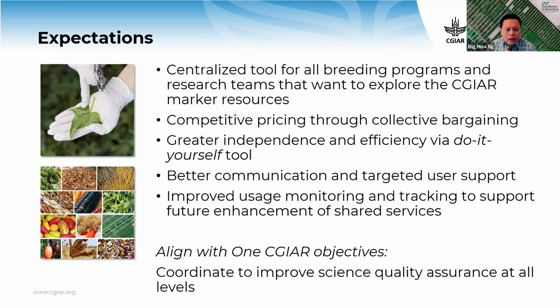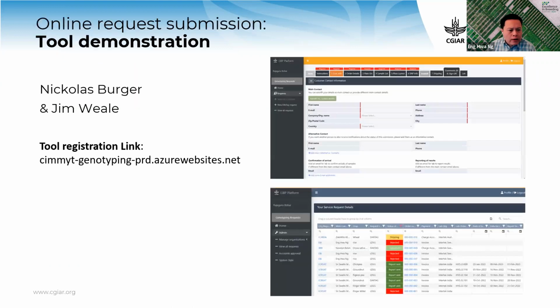for when it's needed. So before I hand over to Nick for the online demo, I do want to point out that I know many people have asked about some features. So this is the first minimum viable implementation for the submission tool. Over the past couple months, we have been collecting some really useful feedback and suggestions for feature enhancements from a couple of our early adopters.